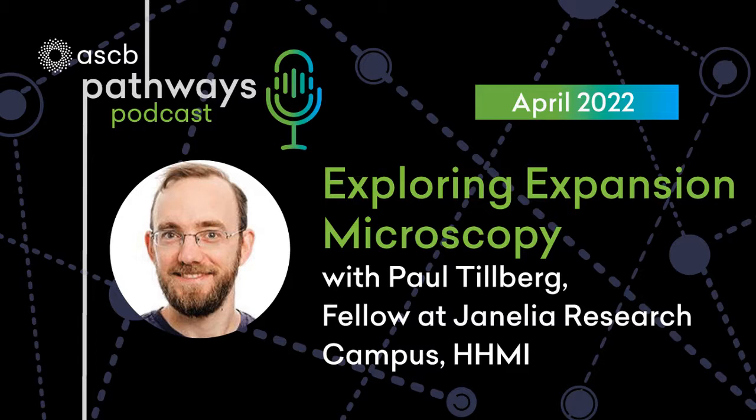Right, but then you have to stack it back together. Yes, you have to stack it back together. So getting a volumetric reconstruction is challenging. And it only really works in the Z dimension. But one of the ideas that we kind of tossed around was, what if we did that 3 times? What if we sliced in Z and then mounted those, and then turned it orthogonally, sliced it again, mounted those, turned it a second time, and then sliced it in the other dimension. Maybe you could just physically slice it up into these 70 nanometer packets and then somehow handle them and separate them from each other. Yeah, it sounds like a headache.